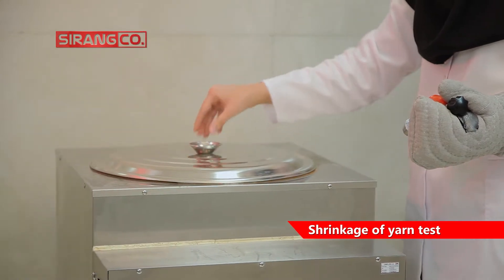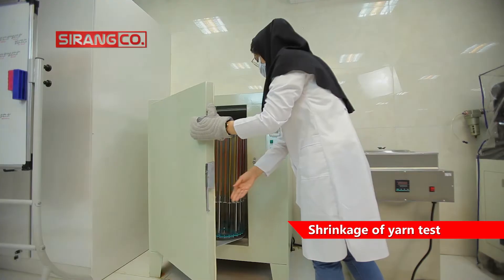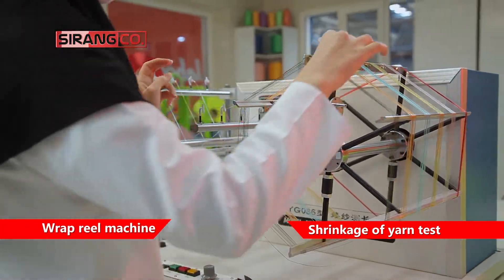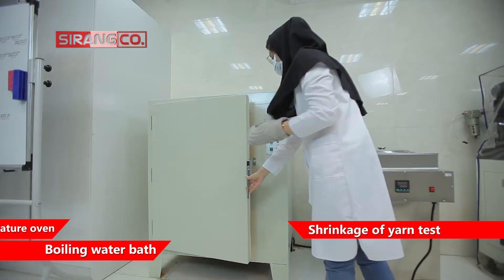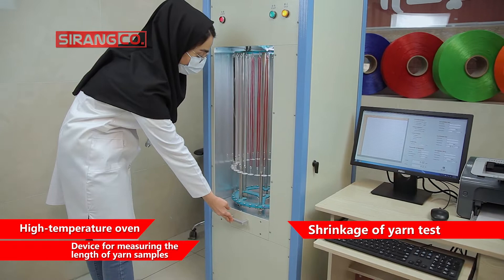In the laboratory of C-Rank company, shrinkage is performed in boiling water and hot and dry air. The equipment required in this test is a wrap reel machine, boiling water bath, high-temperature oven, and a device for measuring the length of yarn samples.